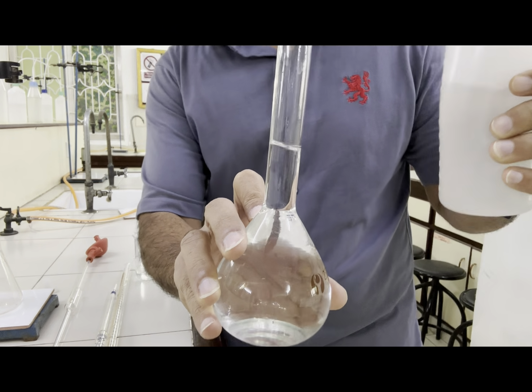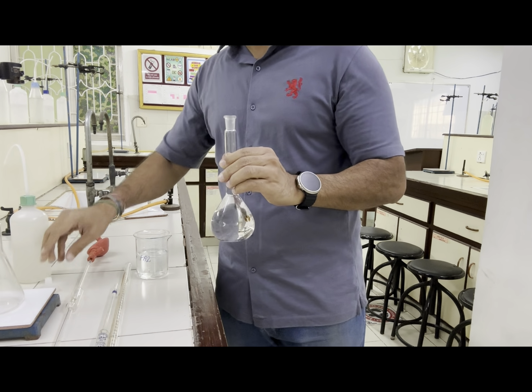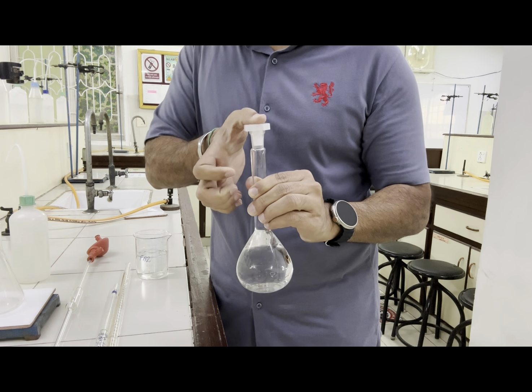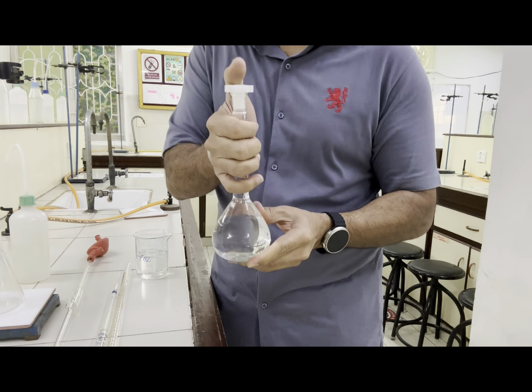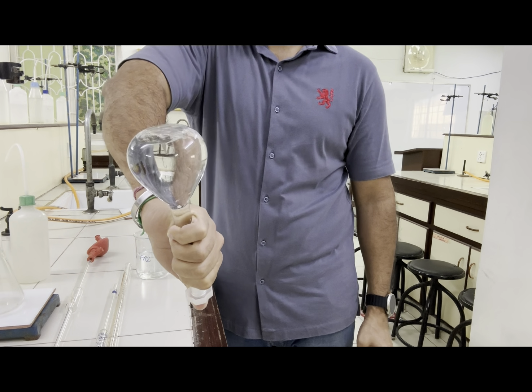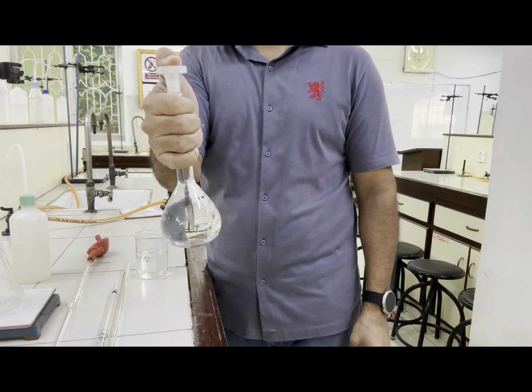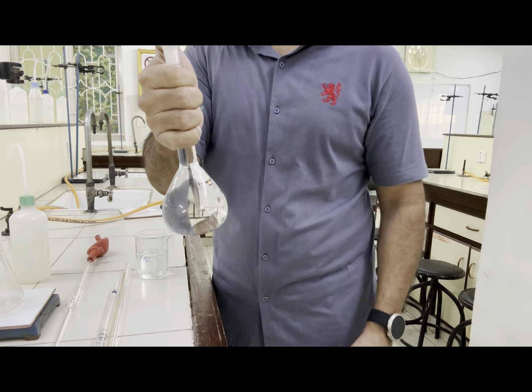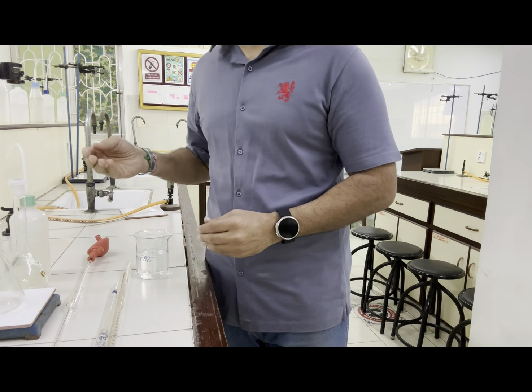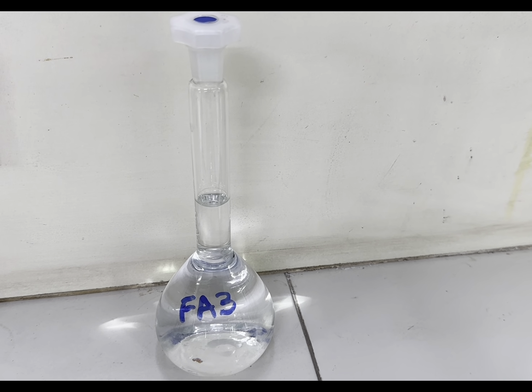And now you can see I have taken up till the mark only. Now you have to put a cap over this and hold this with your thumb and invert this at least 3 times so that the solution is mixed. We call it shake well. And this solution which is prepared now is your Fa3, as the question has said, label this as Fa3. So the solution is labeled Fa3.